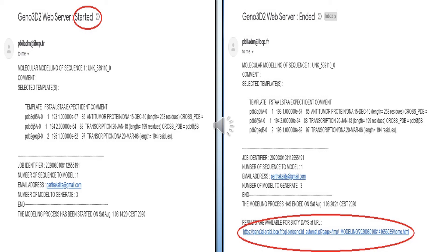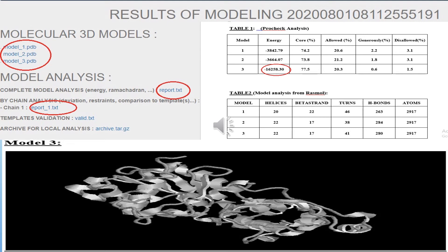After some time you will get one more email stating that your Xeno 3D web server has ended, meaning your results are ready. At the bottom of that email you will find a URL where the results are available for 60 days. Click that URL to see your results. You will see three different models — model 1.pdb, model 2.pdb, and model 3.pdb. Click on each model and it will be downloaded automatically. After downloading, you can visualize them using any visualization software.